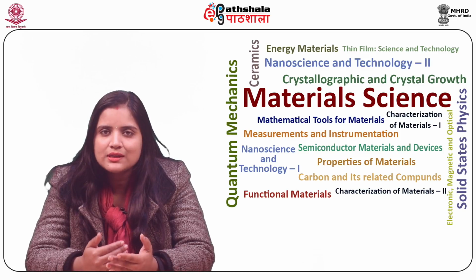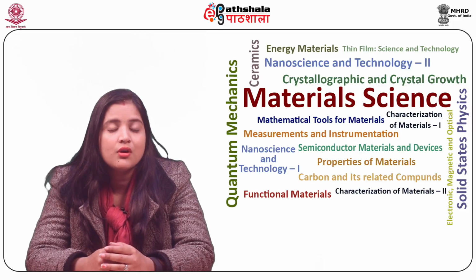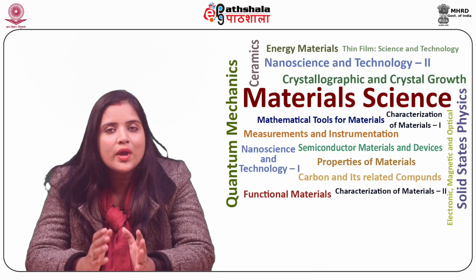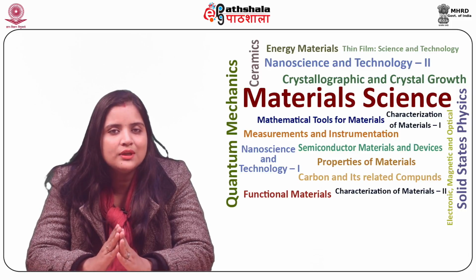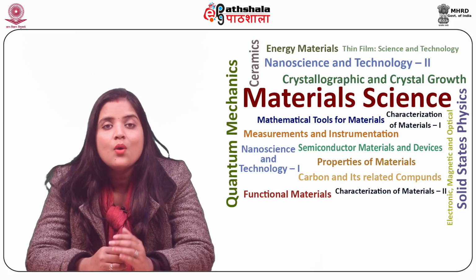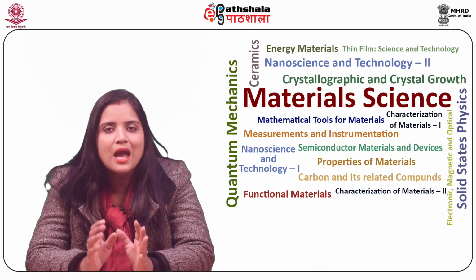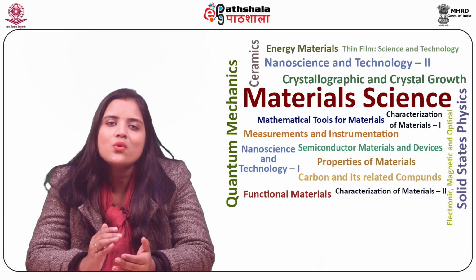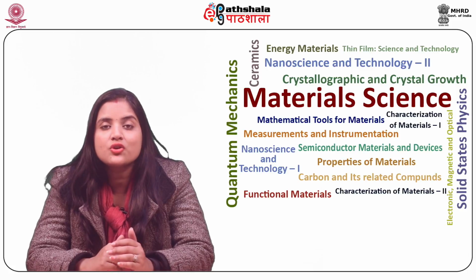Microprobe analysis has a distinctive feature of placing an optical microscope coaxially to the electron beam to find the desired sample area, for which the sample can be scanned with the beam, analogous to conventional scanning electron microscopy.